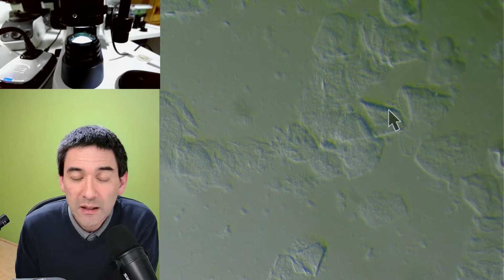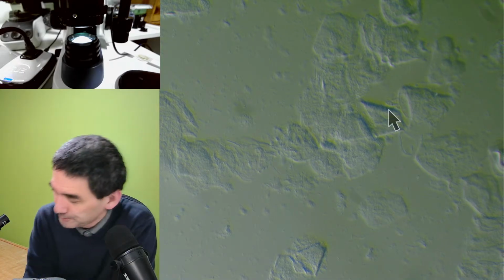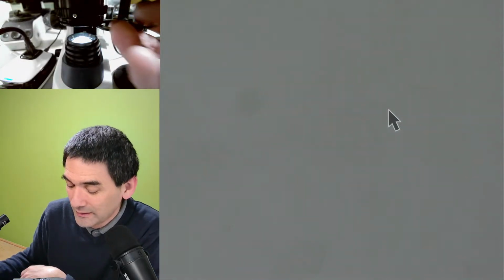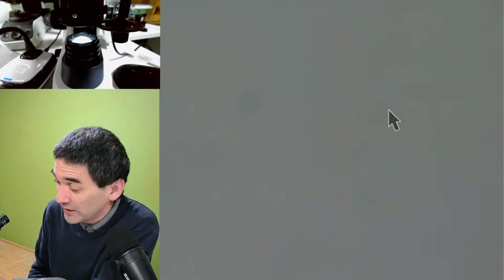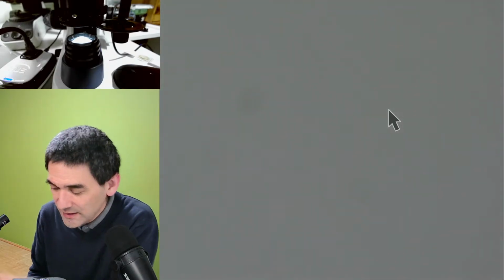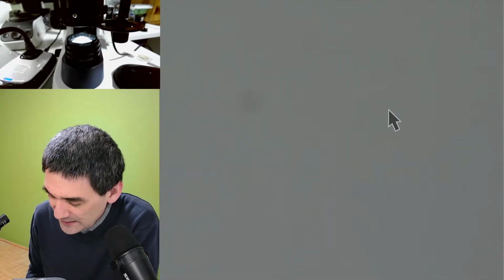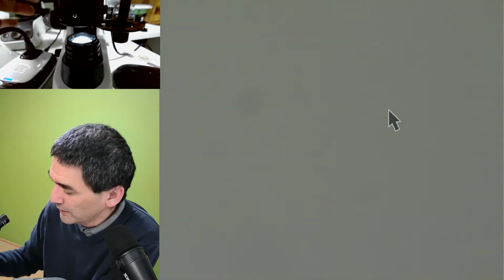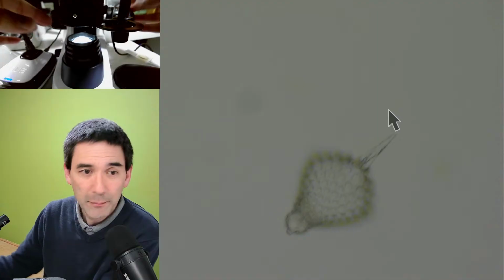How far with the magnification can you reasonably get with dark field or Rheinberg? Okay, honestly, 400 times total magnification is stretching it. The reason is that it's taking away already so much light that it's difficult to see. But let's do the following. Let's go back here and just use this as an example again.